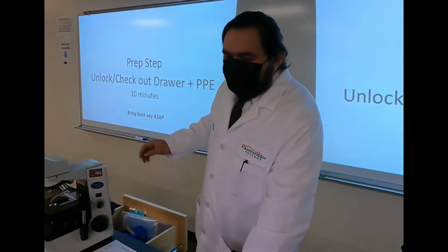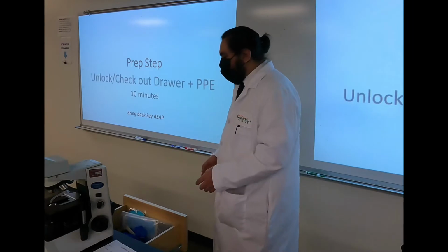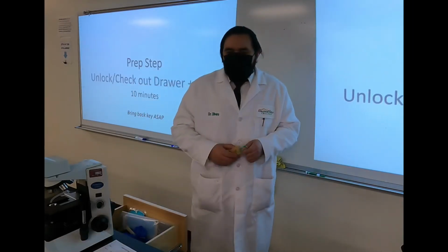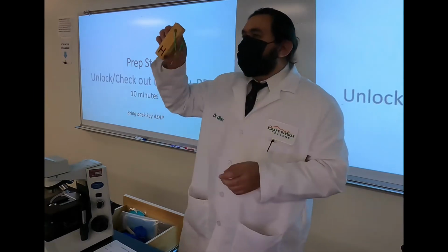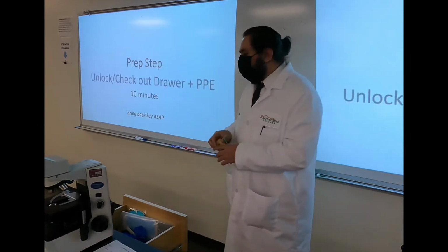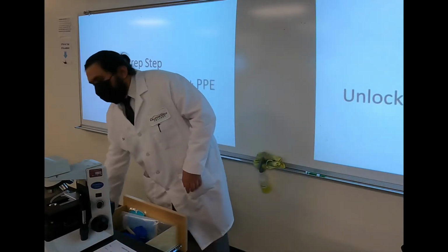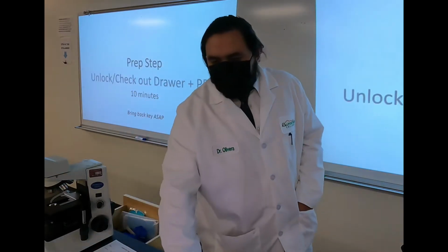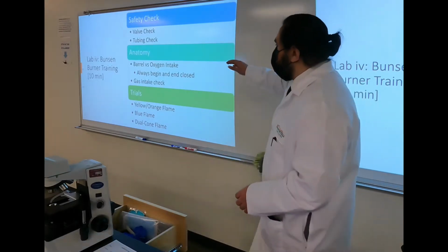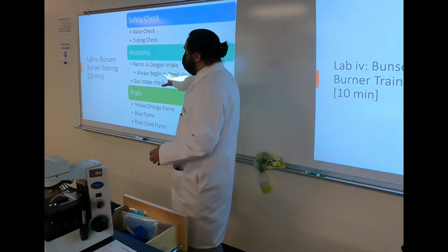So part 1 was to make sure that when you get here, you unlock your drawers. Now, during these times, we have them unlocked and we'll lock them for you. But during other times, you'll find these cool little keys available for you for your bench, for your specific one, that you'll want to lock for yourselves up front, okay? So now that we've done our checkout, we've done everything else, then we'll proceed with our first official lab of the day, which is the Bunsen.